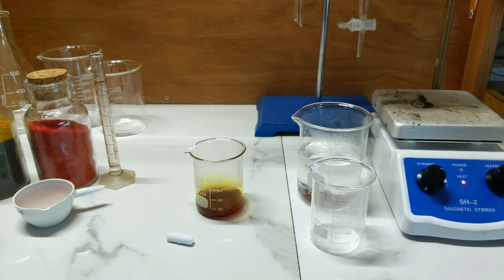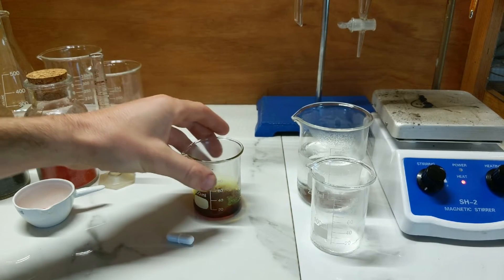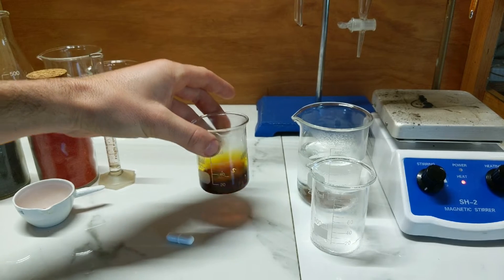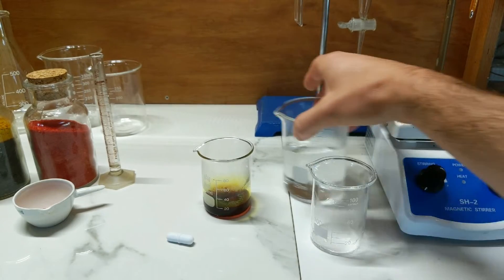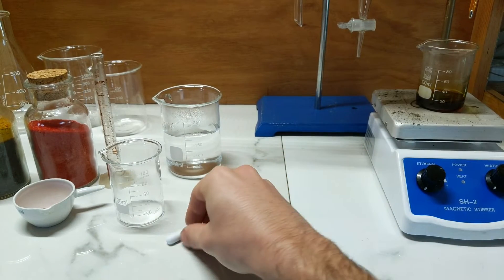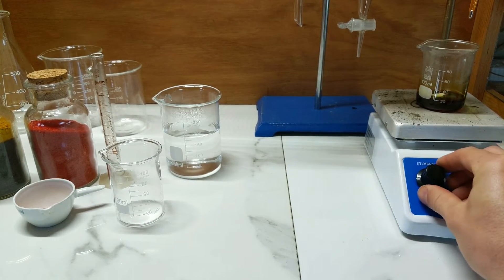To that we will add iron filings. We should put that onto the stir plate, drop in a little stir bar, and get that going.